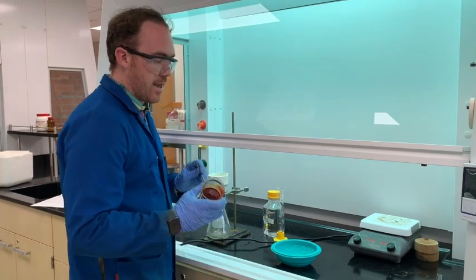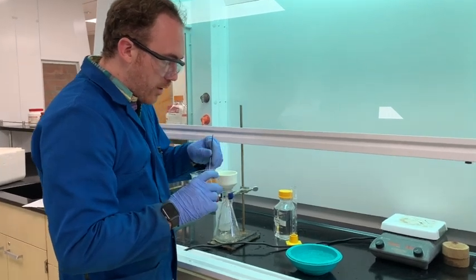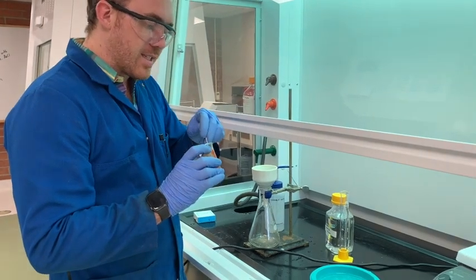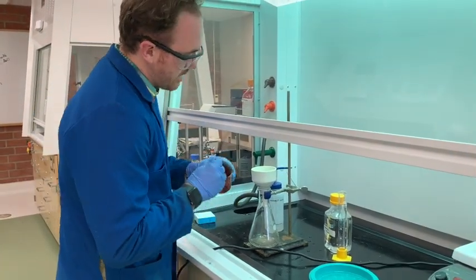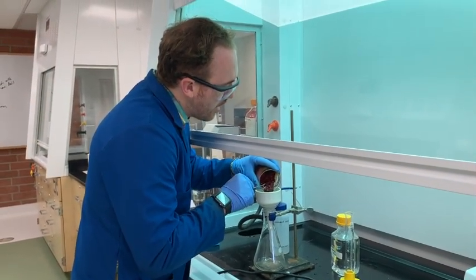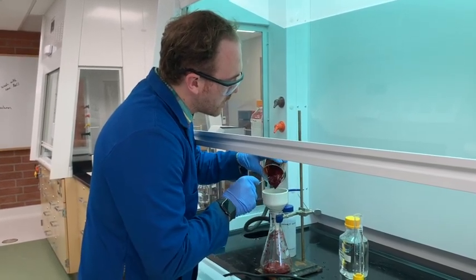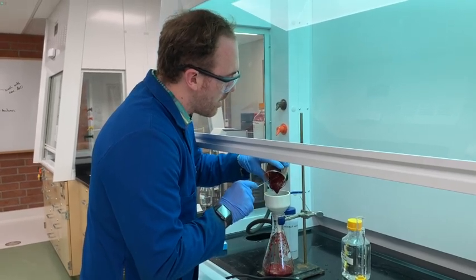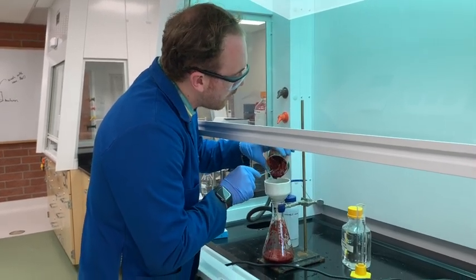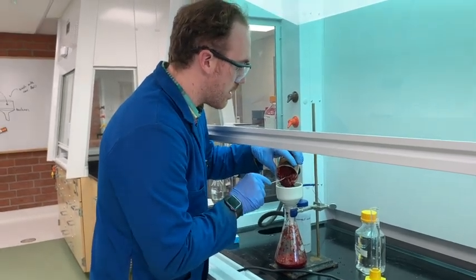Next, since it's just a full solid, just a hunk in here, I'm going to mix it around a little bit. It's just like sludge. And I'm going to see how much of it I can spoon over into this orange sludge, and try to aim for the middle of the filter paper here. That will yield you the best results. It's just like, I don't know, gravy or blood pudding. It's pretty nasty. But it shouldn't be able to get through our filter paper, so we will collect the product this way.